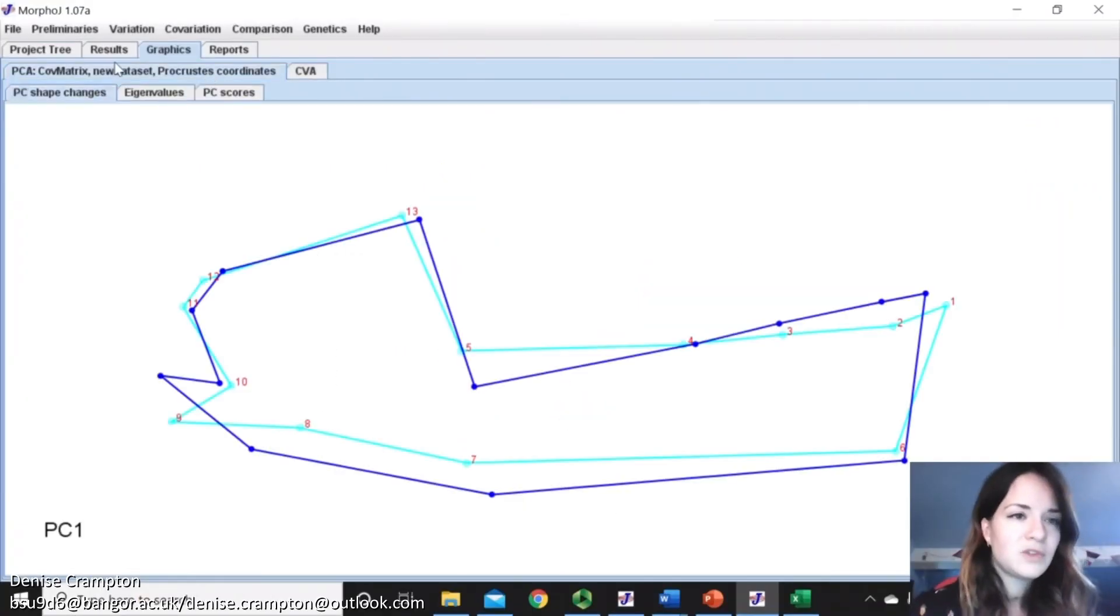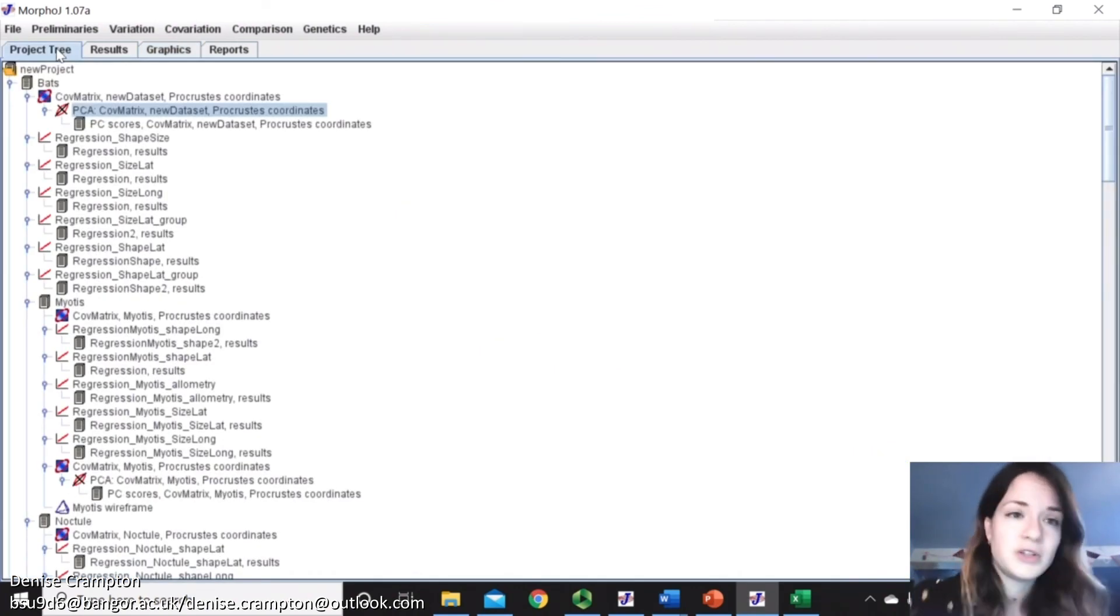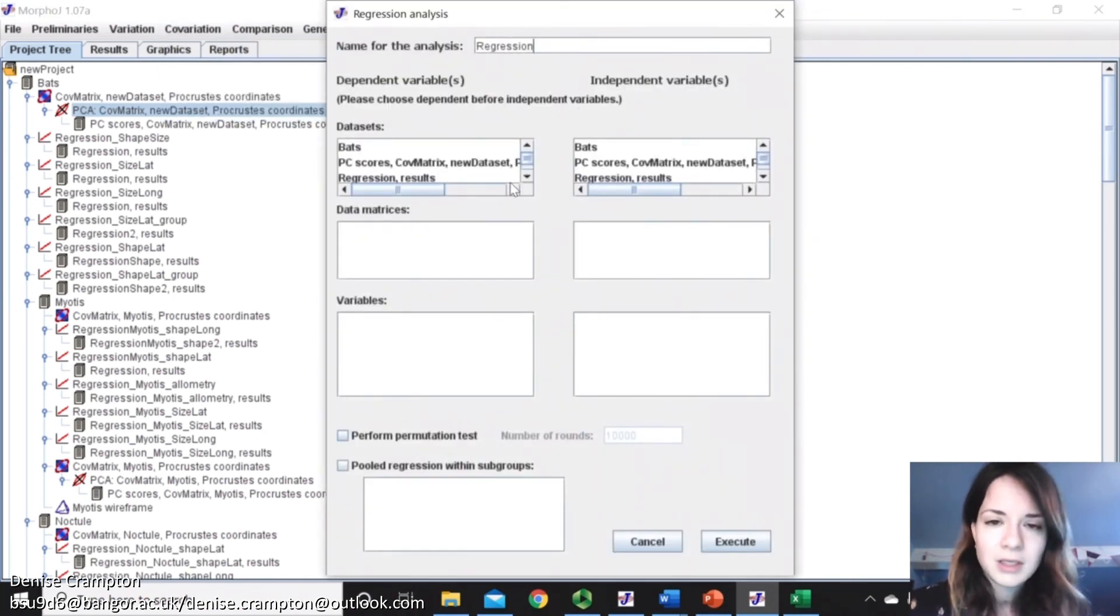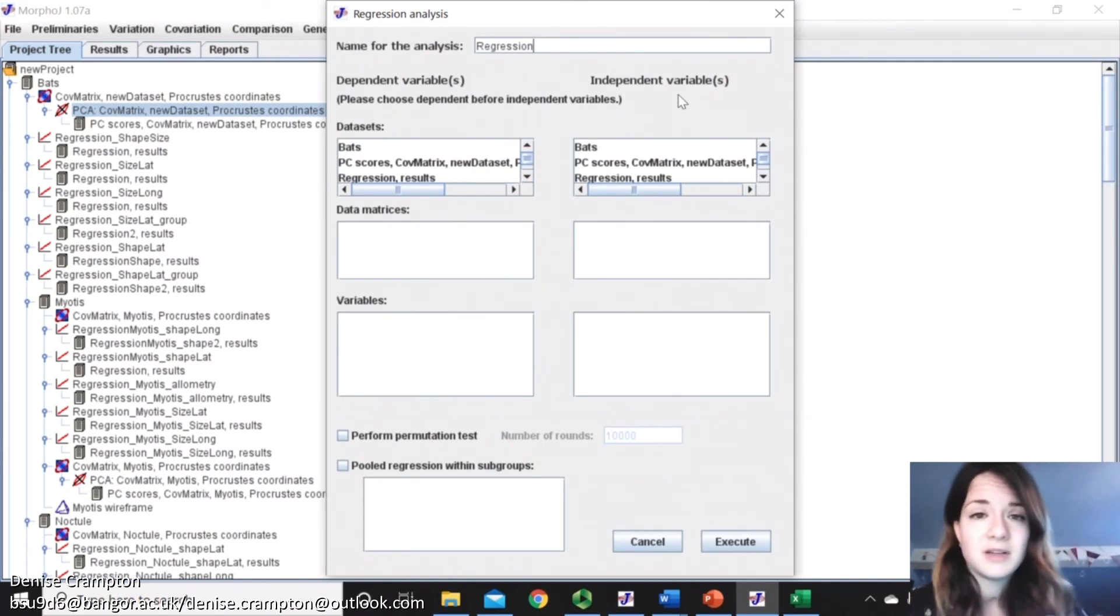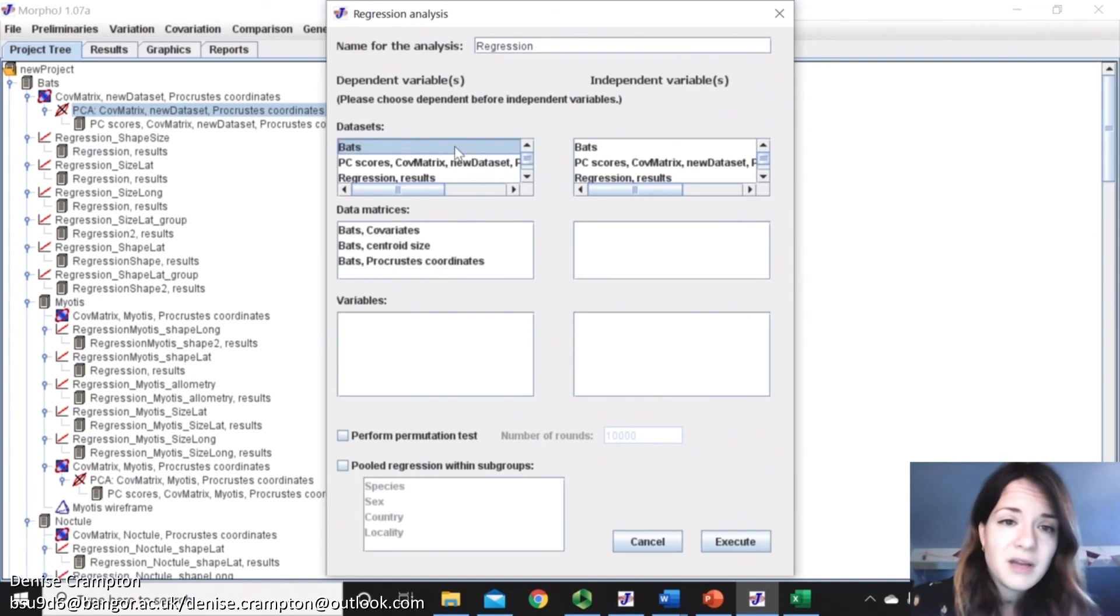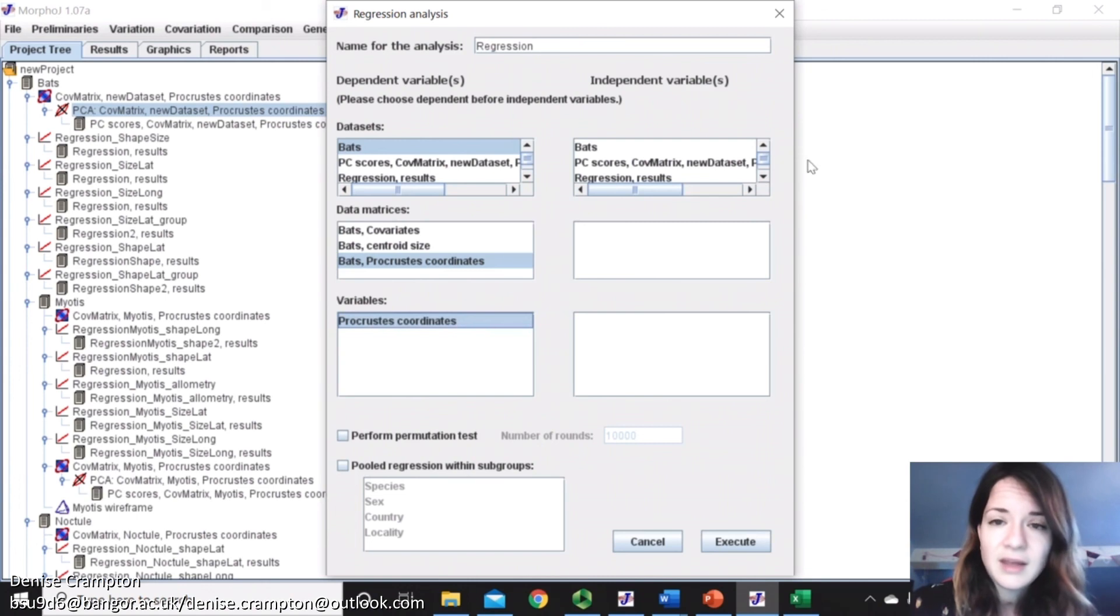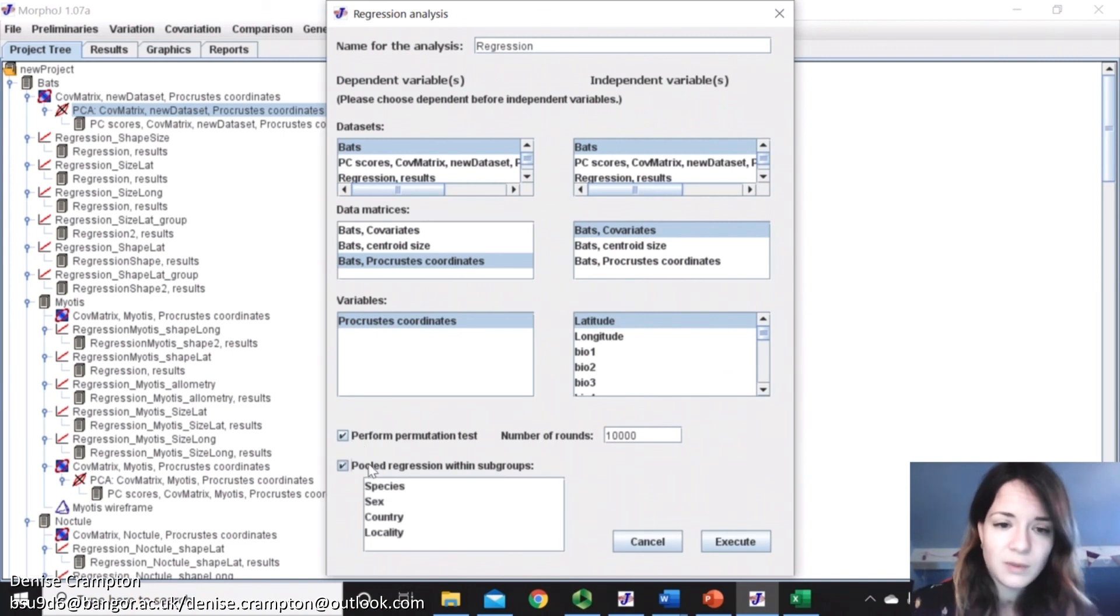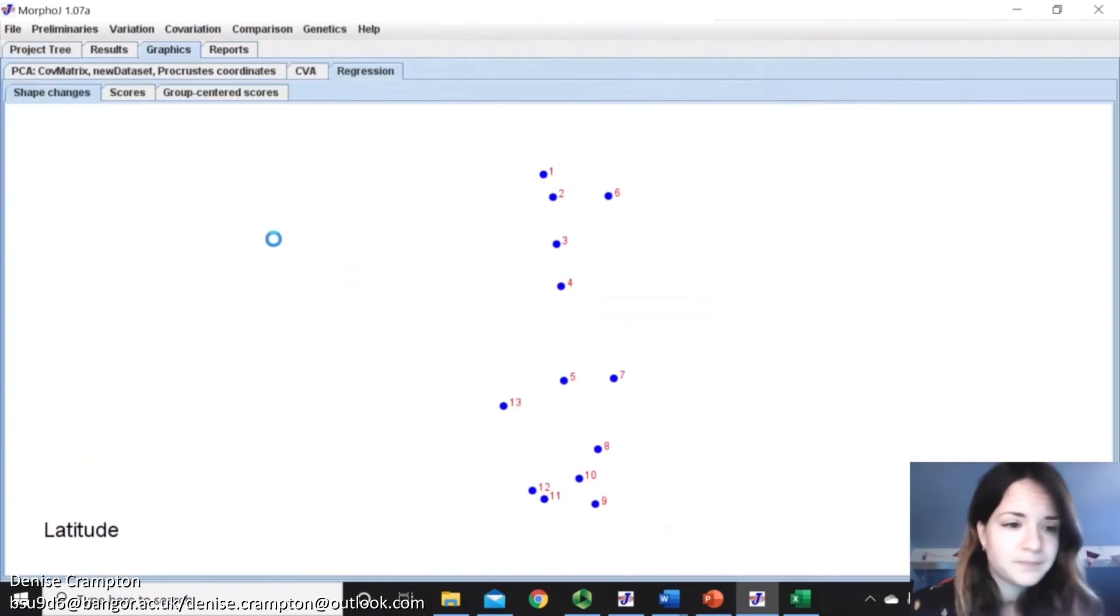We can also do, because this data has longitude and latitude, you can do a regression. So if I go regression, then you can pick your dependent or independent variables. So say for our dependent, we have all the bats, and we have the Procrustes coordinates, you just select that like that. And then you can use your covariate latitude, perform permutation test, you can do a pooled regression of species, execute.